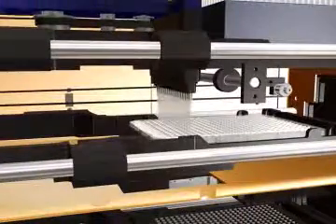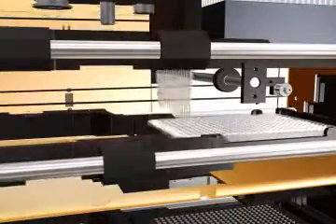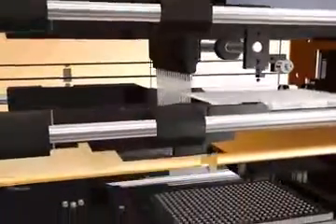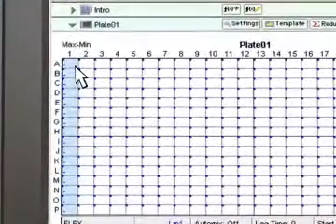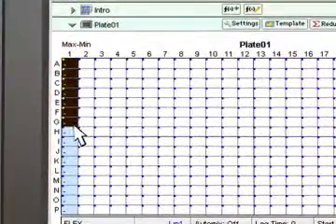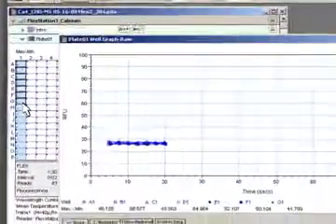The pipetter then transfers the compounds to a column of the assay plate. As soon as the read begins, you can view its progress in the Softmax Pro software.